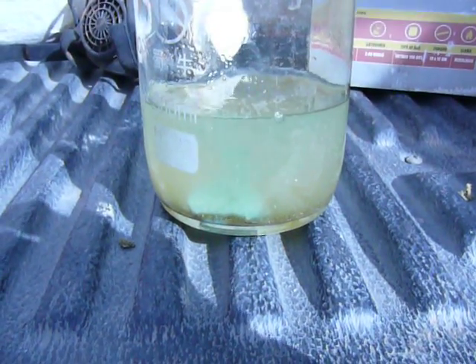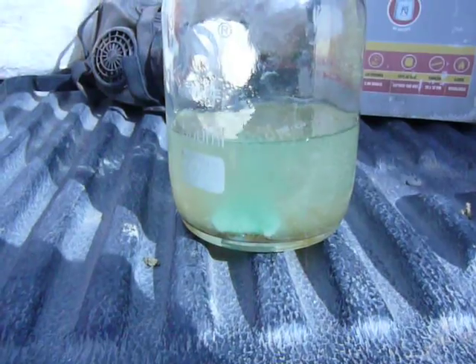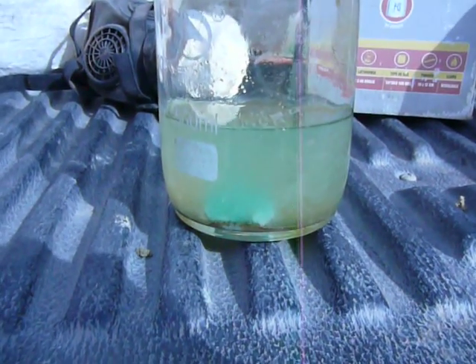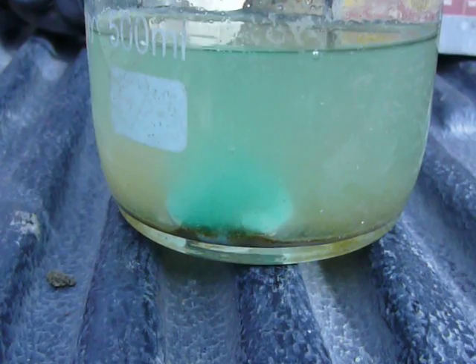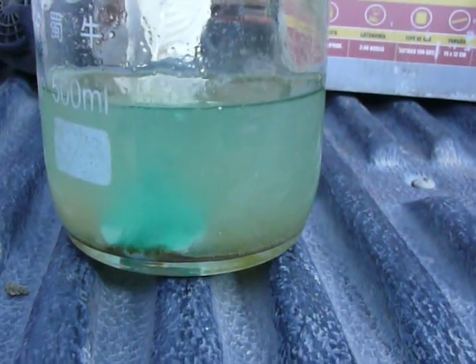Anything that's not gold or platinum will dissolve. There's also a bit of platinum in this mine. The coin is rapidly being reduced.